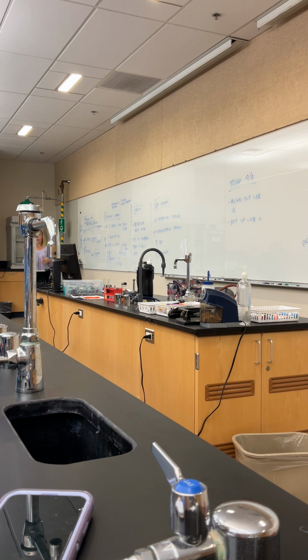And then I could say, what does that mean? What's the whole point of this test? And then I could ask you, is it chemically defined or is it complex? So these are the kind of things you want to make sure you're understanding the results. Okay, so understand the results. I would start by memorizing the organisms and their reactions, and then dive deep into understanding what's happening. All right? Very good.